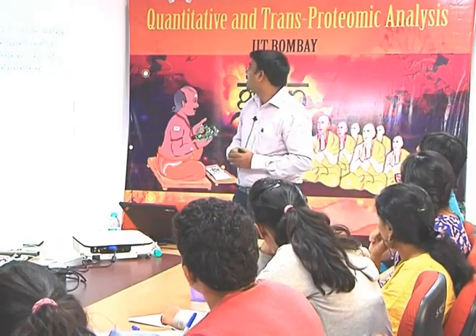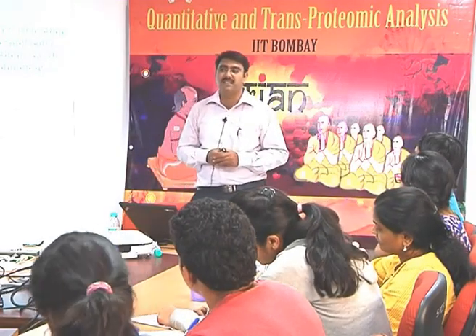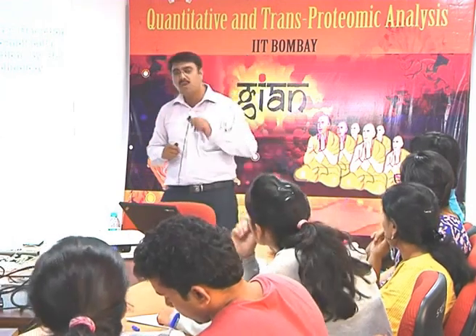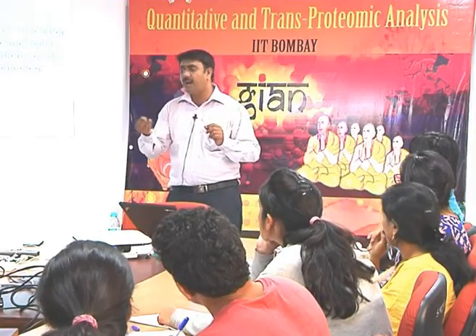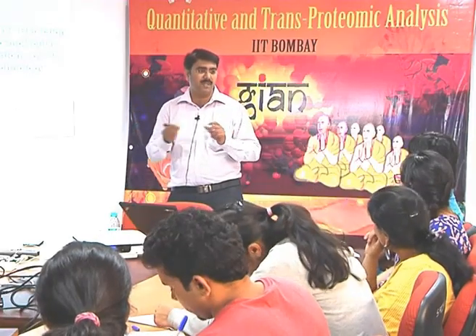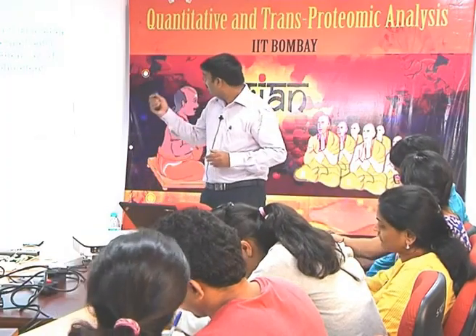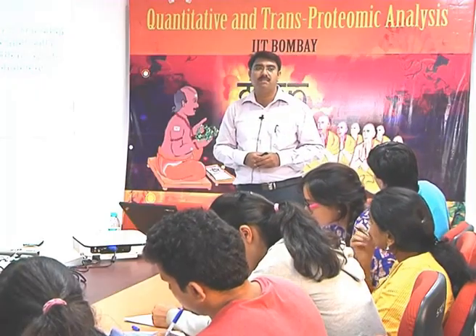Here I am going to discuss the solution-solid interface. What exactly is the solution-solid interface? Suppose two proteins are interacting together; one protein has to be put on a solid support and the other should be in solution form. That is what we call a solution-solid interface. I am going to discuss what exactly this BLI technology is.